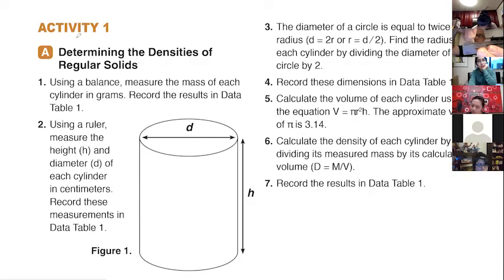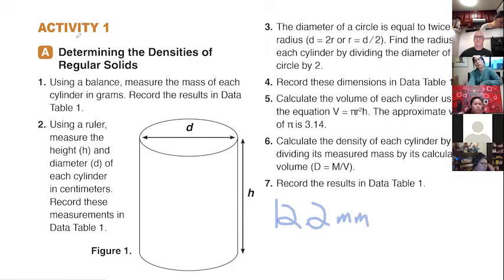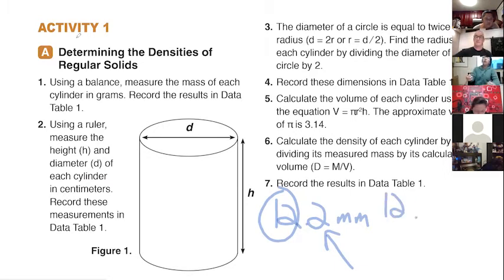It may be in between one of the lines. And so we may measure the height as, let's say, 12.2 millimeters high. So it's a little longer than 12 millimeters, but not quite 13. So these two digits are significant because it's definitely greater than 12 and it's not 13 millimeters. We can clearly see that. But this last number is an estimate made by you. So if you think it's right in between 12 and 13, you would write 12.5.